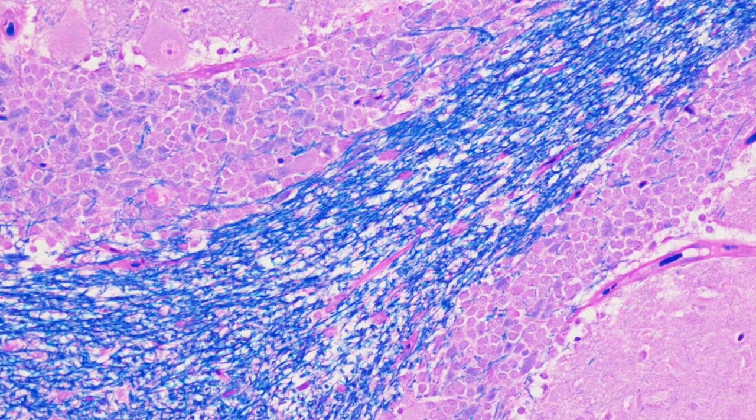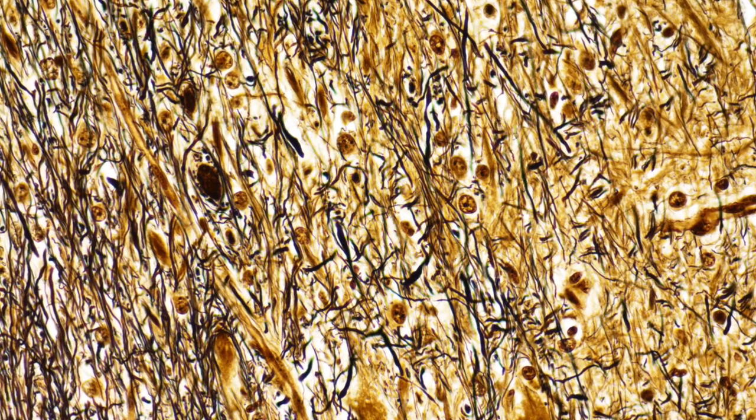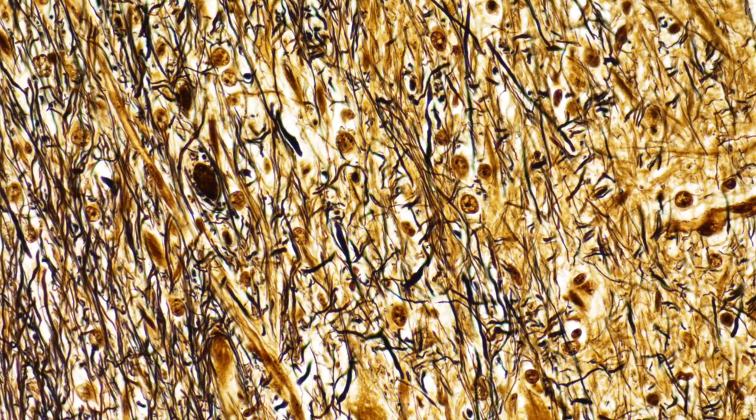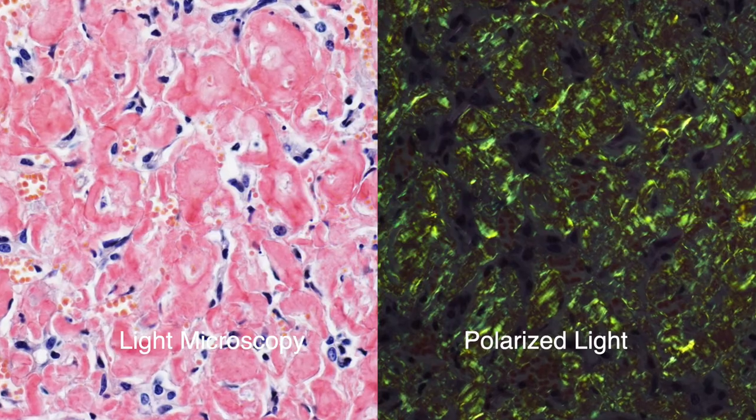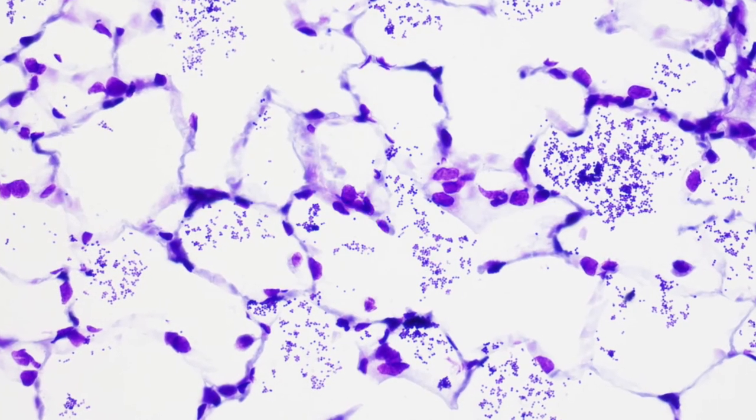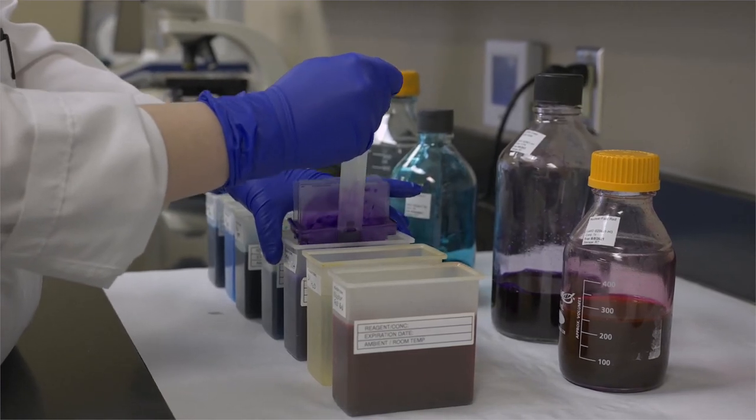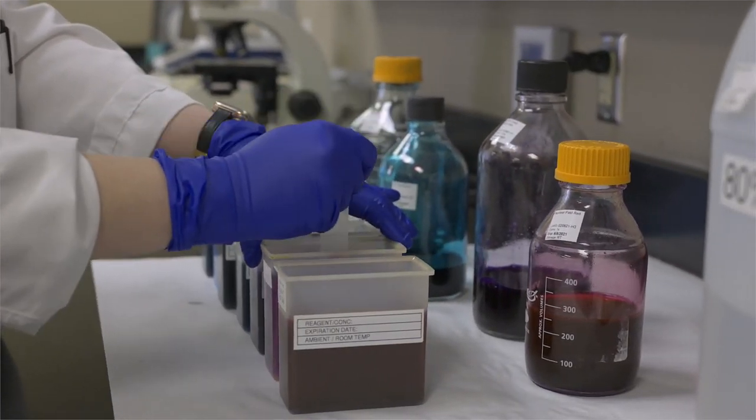Luxol Fast Blue to stain myelin. Bielschowski to demonstrate neurofibrils, axons, dendrites, neurofibrillary tangles, and senile plaques. Congo Red to identify amyloid and Gram to detect bacteria. We offer four different chemical stains on our ground section plastic slides. The most commonly used stain is pentachrome.